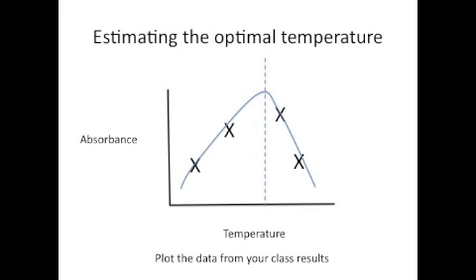Using the class results, you will be able to estimate the optimal temperature for the enzyme. Remember to use the plot intelligently. First put the points and then use a best fit to join the points.